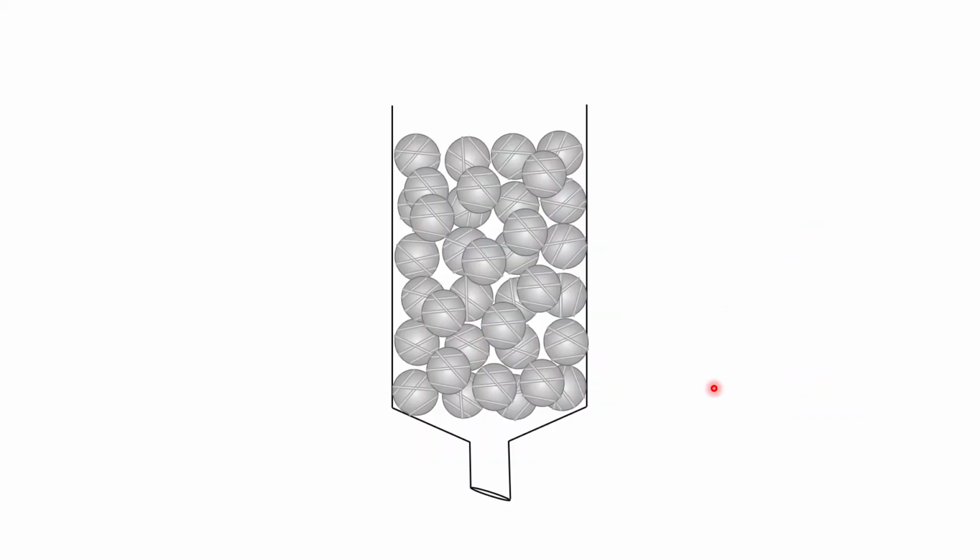Looking at the column, again we have a globular protein, and as we run, the larger molecule is eluted first and afterwards the green species. Even if one or two small molecules bypass one or two beads, there are many more layers, so they will get trapped in other beads.